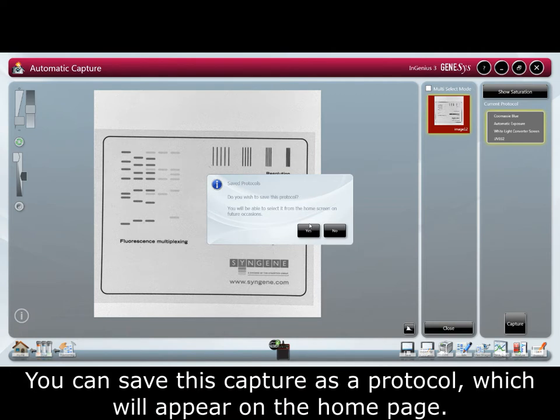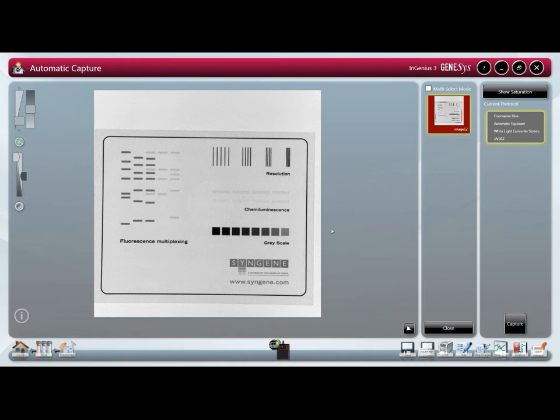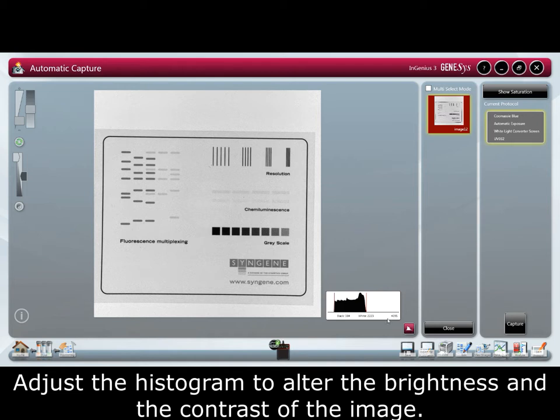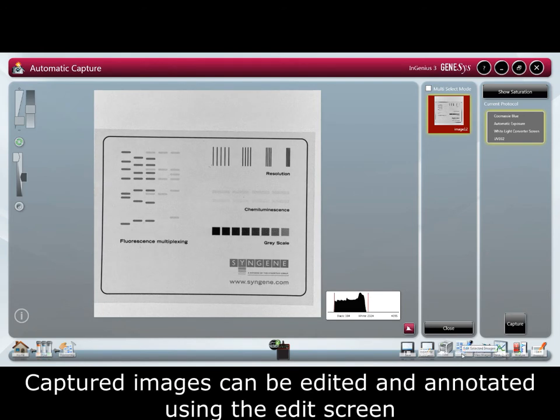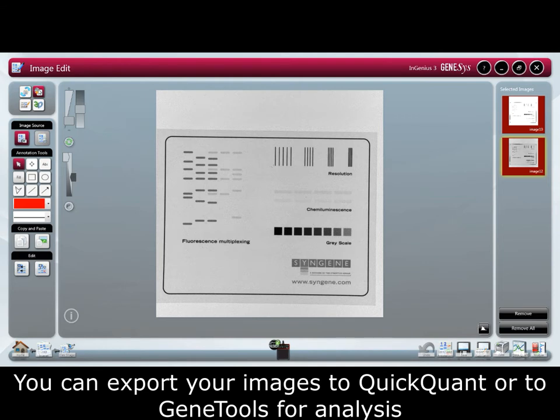You can save this capture as a protocol which will appear on the home page, saving you time as it takes you directly to the sample positioning page. The histogram shows you the number of grayscales captured by the camera. Adjust the histogram to alter the brightness and contrast of the image. Captured images can be edited and annotated using the edit screen. You can export your images to QuickQuant or GeneTools for analysis.